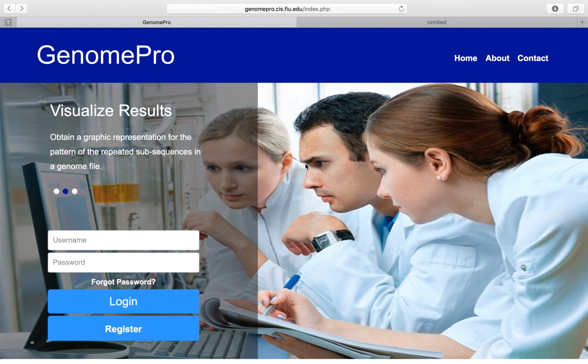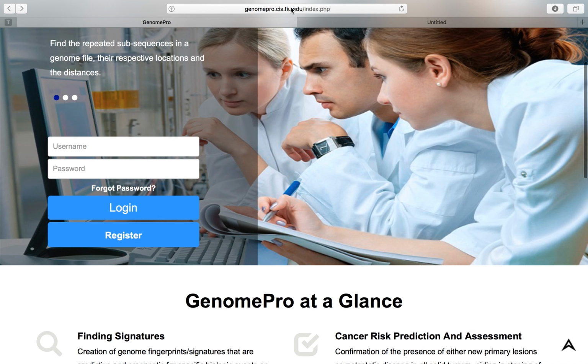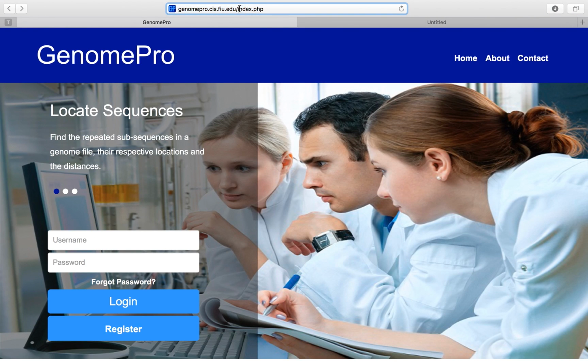Hi, my name is Daniel Gonzalez, and I'm going to walk you through how to use Genome Pro 3.0 as a user. So, the first thing you're probably going to want to do, if you want to use Genome Pro, is navigate to the Genome Pro website, right here. It takes you automatically to the index page.